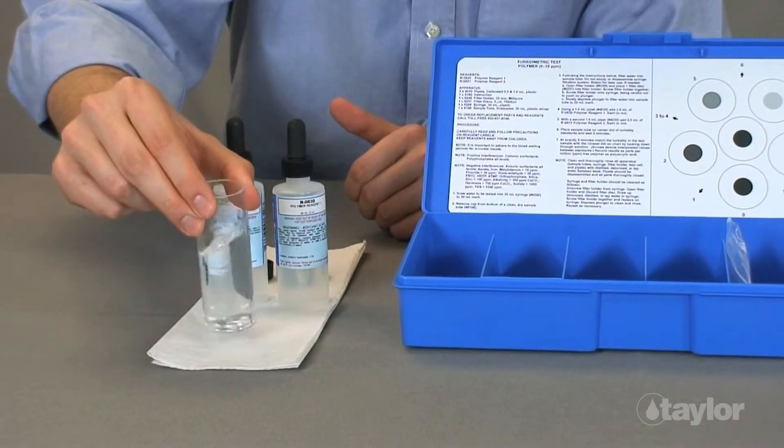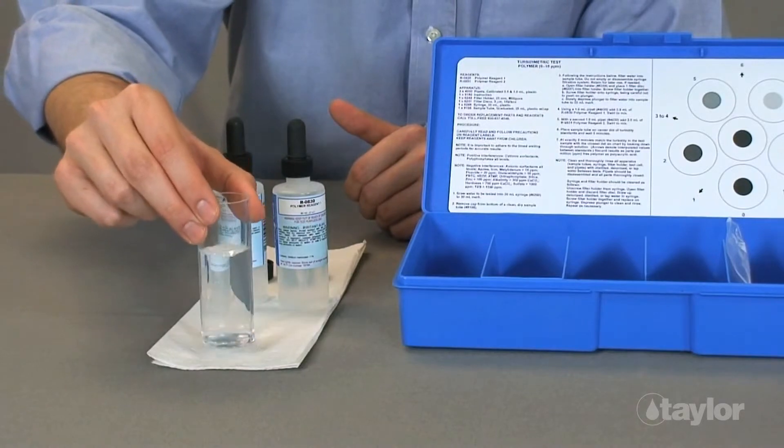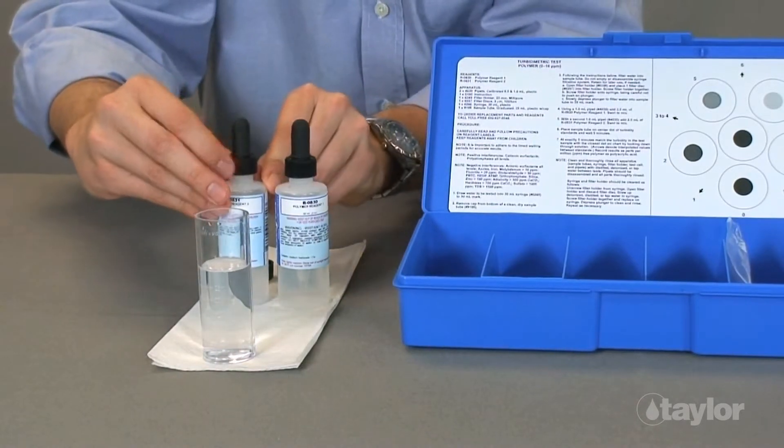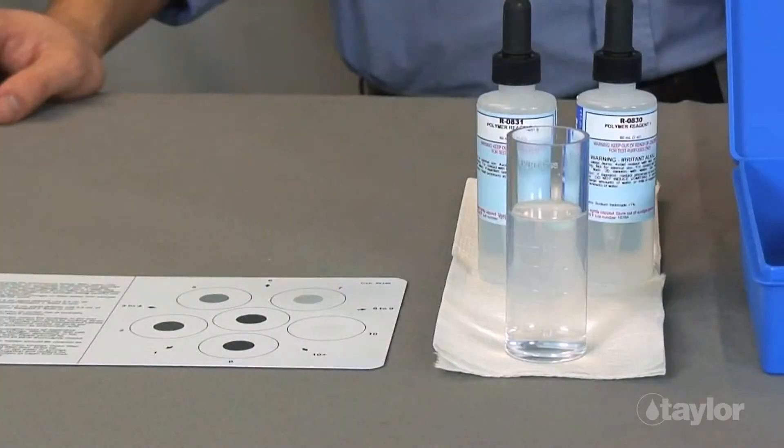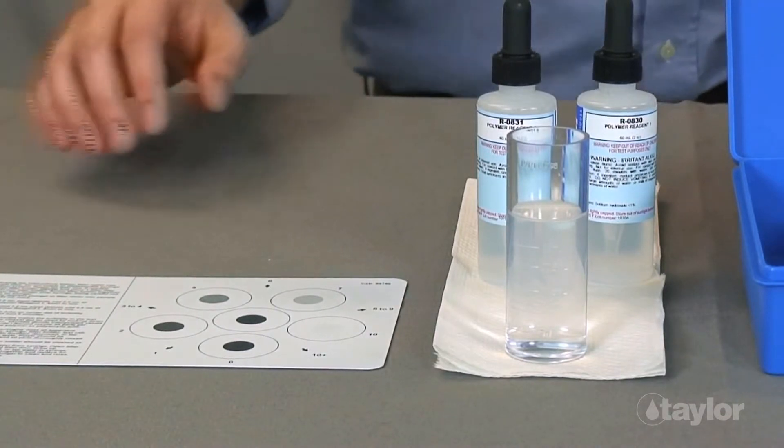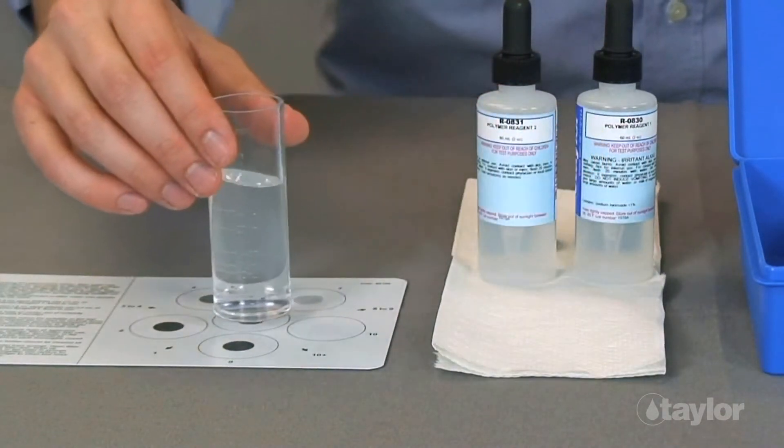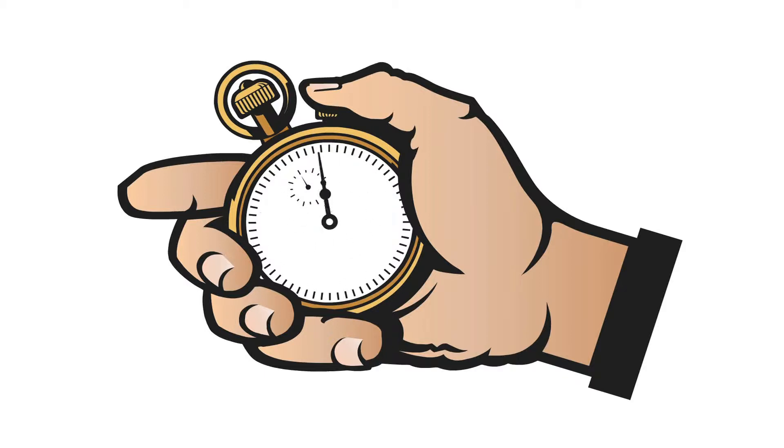Again, swirl to mix. Place the sample tube on the center dot of the turbidity standards provided in the kit. Wait 5 minutes by the clock.